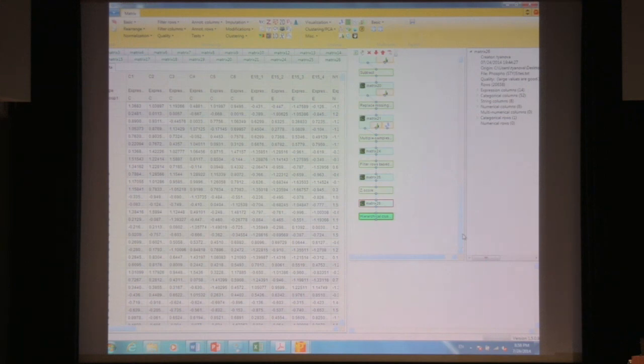So, yeah, okay, so this is still, yeah. We have 2 minutes or what? I'm not sure what you mean. There is no strict assumption of normality, but of course z-scoring makes most sense in case you do have a normal distribution across your rows.